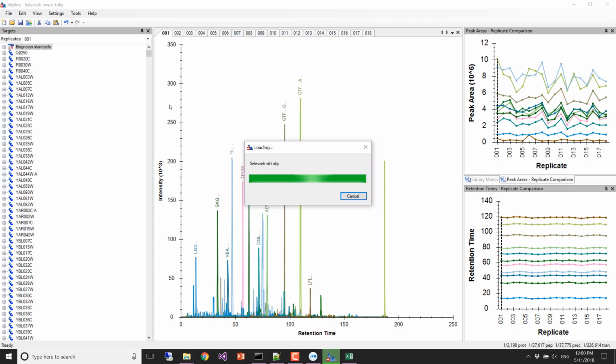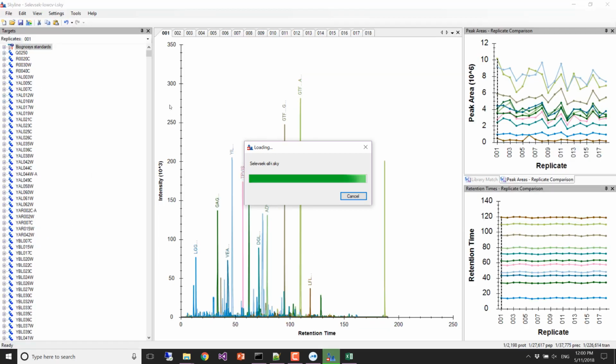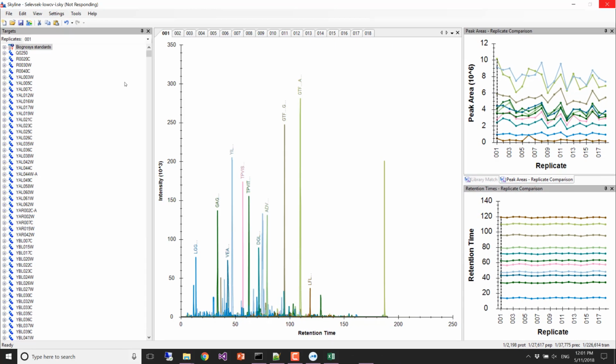So who thinks that they would prefer to measure 3 times as much stuff because they might actually find something that they won't find if they do that refinement step? Ben, come on, man. Ben would prefer. Sometimes, yeah. There you go.